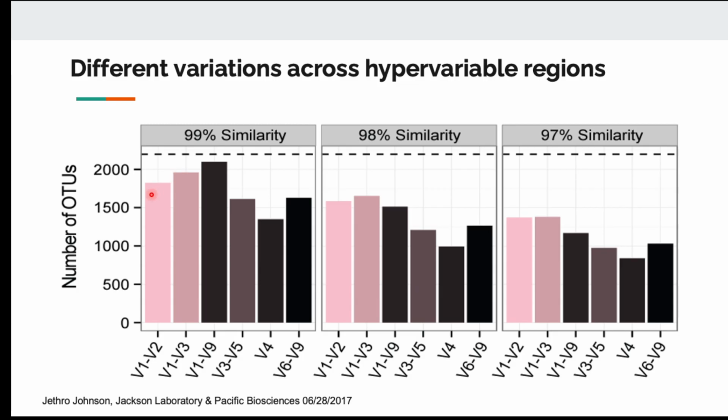So nowadays, when we perform 16S RNA sequencing, a long read will give you the whole sequence. But even if you do short read with Illumina and get only 2 of the 9 hypervariable regions, you're not losing a lot. So people nowadays are not sequencing the whole thing. They are sequencing maybe 1 or 2 hypervariable regions, and that's good.